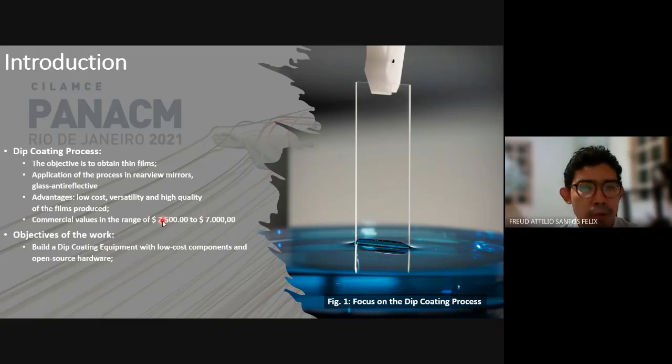The objective of this work is to present the results of building a dip coating equipment with low-cost components and open source hardware. And here we can see a little about how the process works, but we will see more about how it works in the next slides.